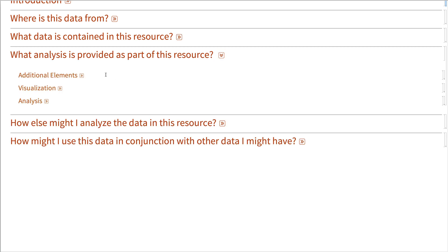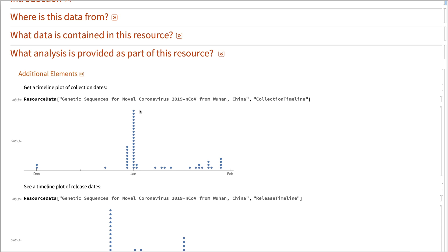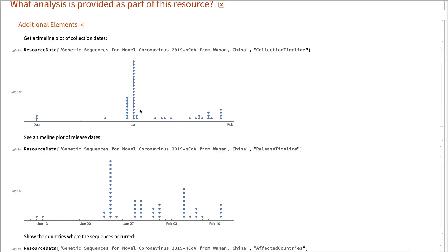As part of the analysis that comes with this Wolfram data repository item, we also provide some timelines. So you can see the timeline of when these samples were collected.